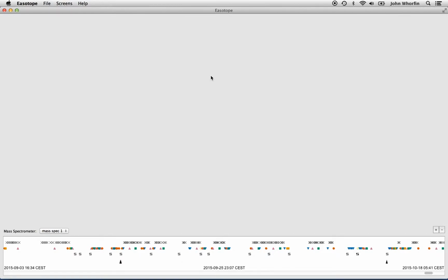In this video, I'll explain the first half of the replicate analysis screen. This video will take you up to the standard offset tab, and then the second video in the series, part 2, will cover the replicate steps in the replicate analysis.